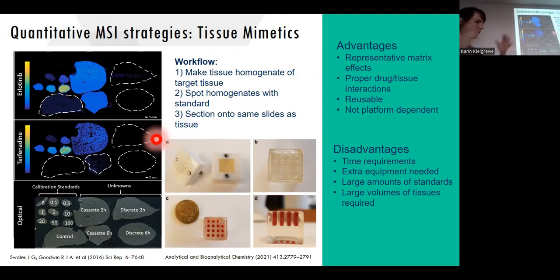Another thing is that we've got everything in one spectrum again. So generally MSI is a qualitative method. Even if you've got 2 different tissue types on one section, like tumor and connective tissue, you cannot really say this is 3 times as high as in this one without doing some degree of quantitation. They've got a different chemical background in those 2 different tissue types, so you cannot really compare directly how high your compound is.